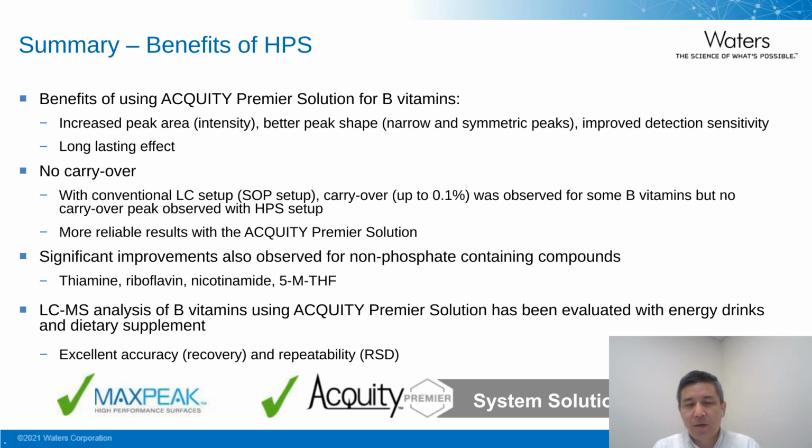We also noted there's no carryover observed with the Acquity Premier solution. So it indicates that more reliable results can be obtained with the Acquity Premier solution. And during the investigation, we found that significant improvement was also observed for non-phosphate containing compounds. For example, thiamine, riboflavin, nicotinamide, and 5-MTHF are not phosphate containing compounds.